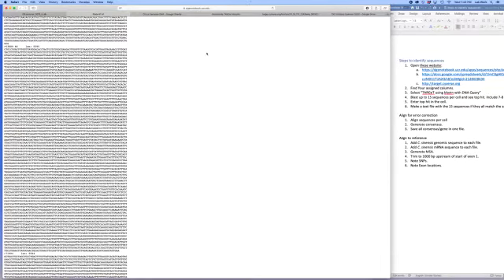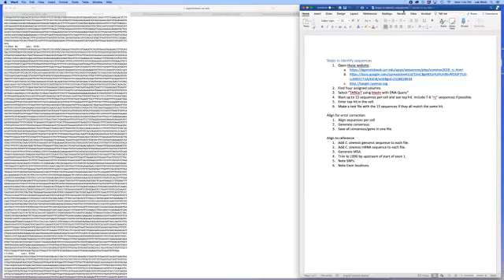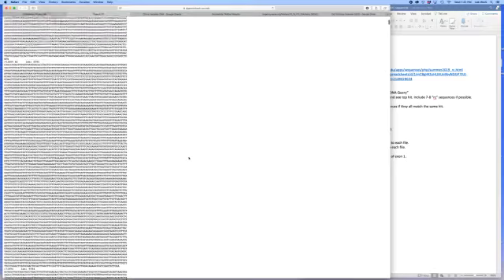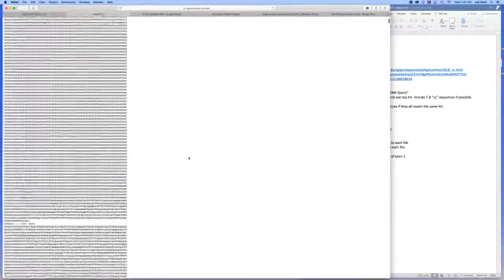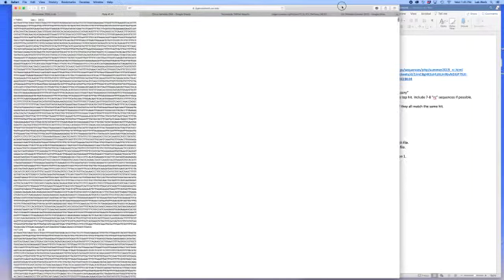Okay, and then next, if you choose to help us out, even though the program officially ends on Friday, the next thing we're going to do is align for error correction, and then we will take those corrected sequences, each one for each variety, and align them to the reference, which is Citrus sinensis, the sweet orange, and then prepare everything for uploading to the database, because this sequence now looks really good, and we will be able to upload to GenBank. So, as much help as I can get from you guys, the easier it will go. Okay, so get to work on this.